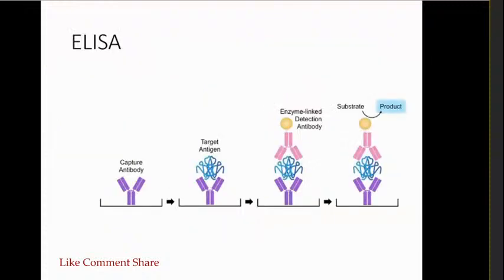In this experiment, we are going to explain monoclonal antibodies with diagnosis methods. First, it's a sandwich ELISA experimental method. It's a direct interaction. In this image they explain how the antibody interacts with the antigen. First step, the antibody is placed in the medium. How do they produce this antibody? Same as explained in the previous slide, they produce the monoclonal antibody artificially. That antibody is coated on the surface.